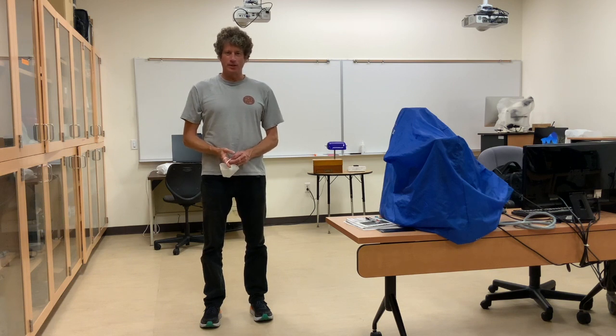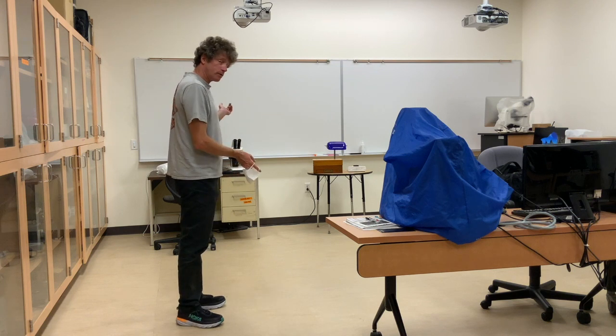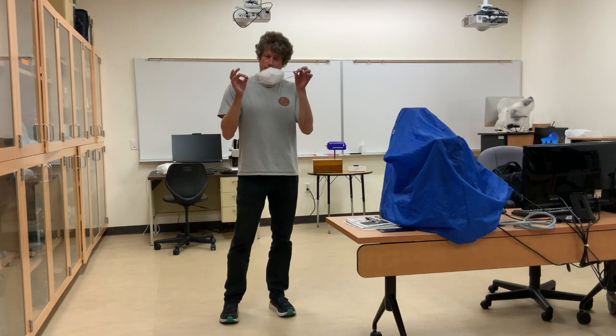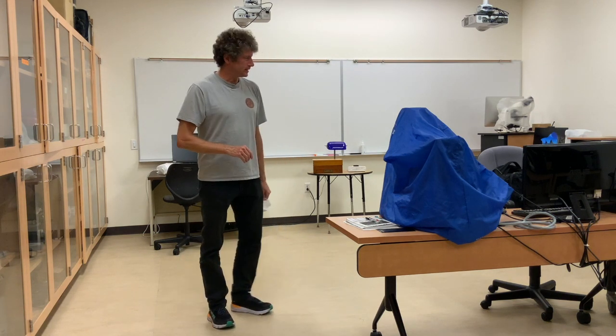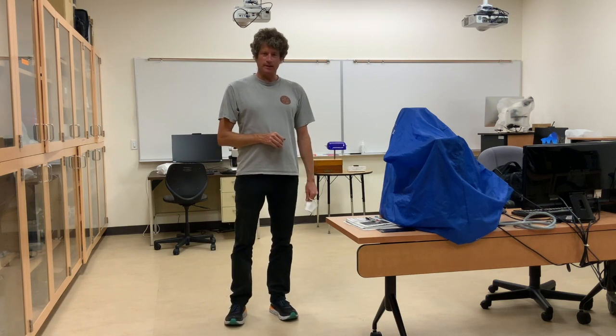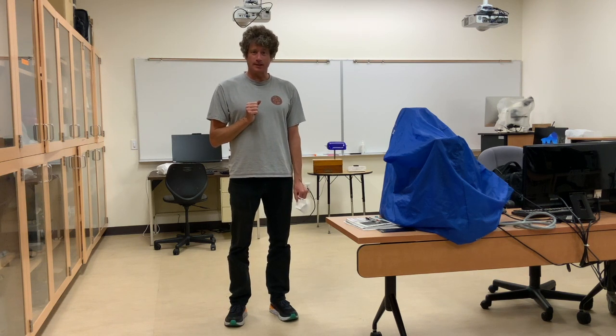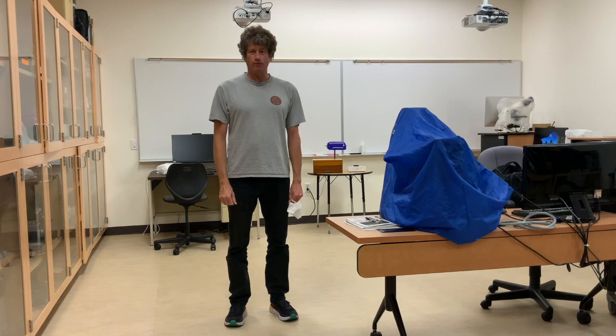Hello everyone. Welcome to another lab room in the Bioscience at Merritt College. I'm going to show you some of the dissection scopes in the back of the room. When you're using them, please do mask on. There are other microscopes in here too. This is room S116 and I'm going to take you in the back and show you the Leica dissection microscopes EZ4W.